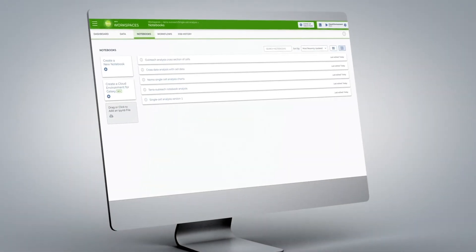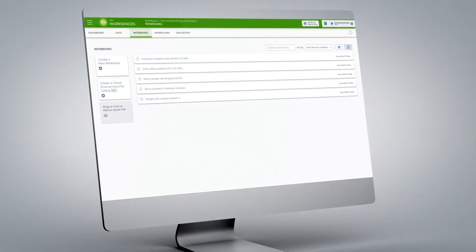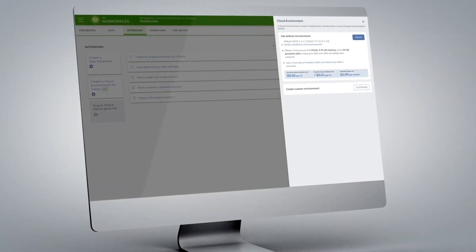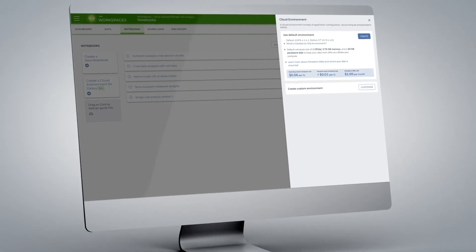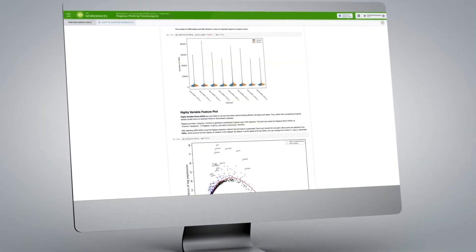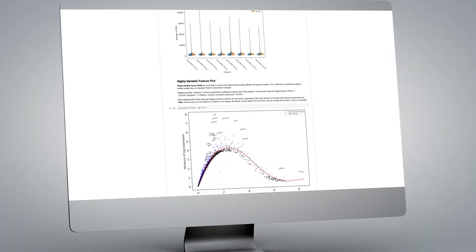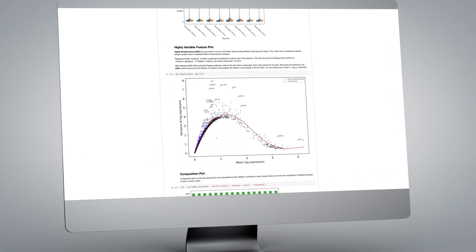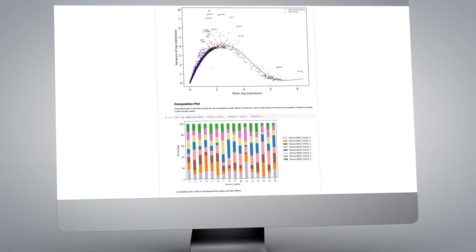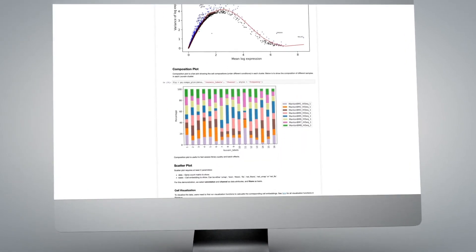To work with your data in real time, spin up an interactive cloud environment from a simple menu and use applications like Jupyter Notebooks and RStudio to run code and visualize results.